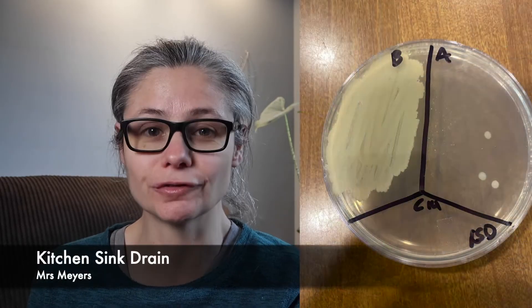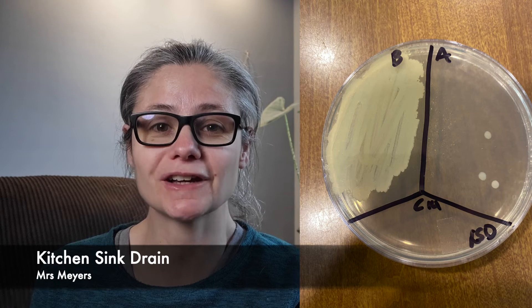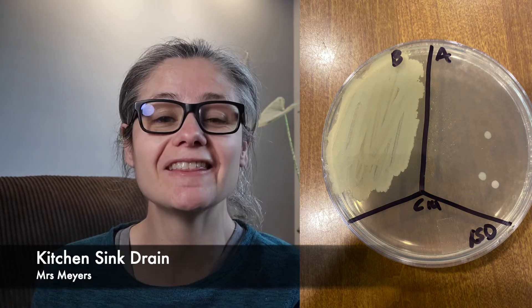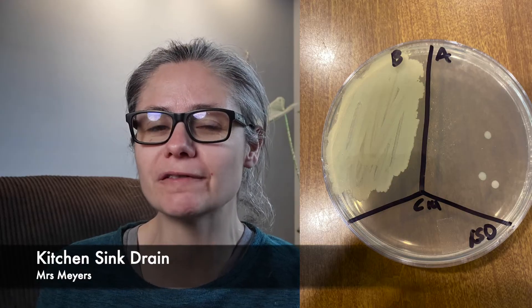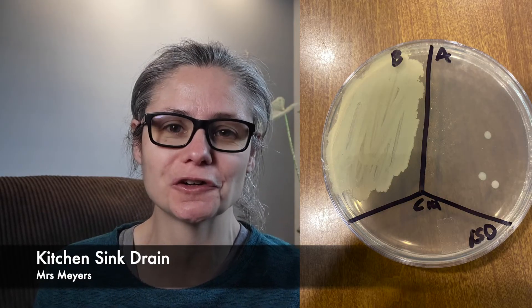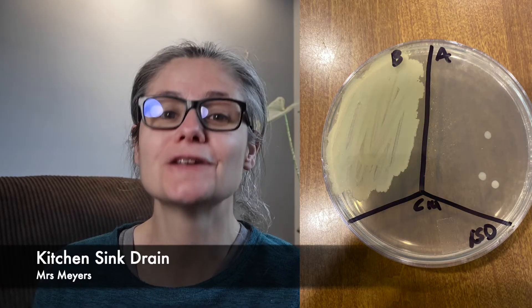The kitchen sink drain. The before section has a ton of bacteria — it's a huge smearing of bacteria. And in the after section, you can see three big visible bacteria, and there's also about half a dozen tiny bacterial colonies floating around there. So Mrs. Meyers does a great job at removing bacteria from my kitchen sink drain.